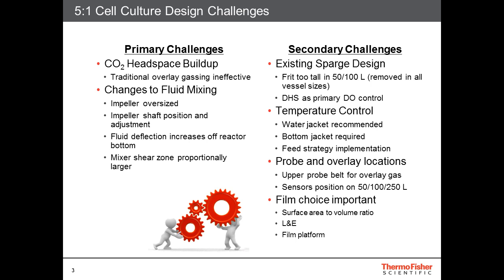Now, what we have understood from scientific experiments as well as a large number of studies is that when the volume is lower, the carbon dioxide buildup in the headspace creates a lot of problems. In order to avoid that, having an overlay on the top may not be enough.